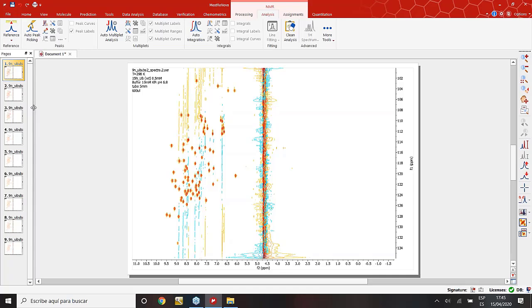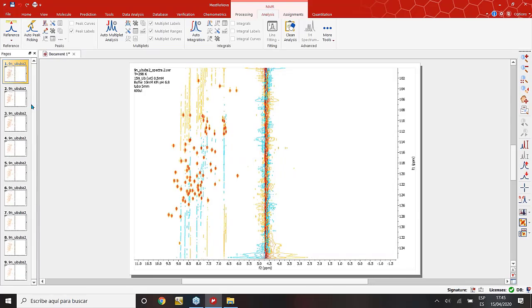As we are interested, I guess it's worth mentioning. Maybe you're going to do it, but these would basically be HSQCs acquired for different concentrations of the ligand against the protein. You're probably going to show that with the tables, but just so that people have the context, I thought I would mention it now. Yeah, as Santi said, those are HSQCs.